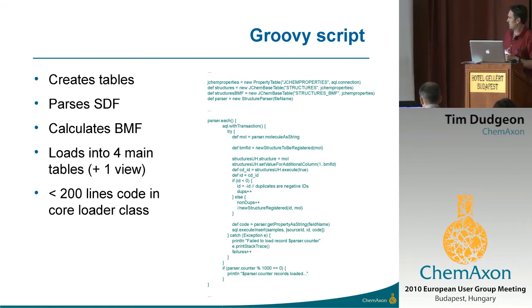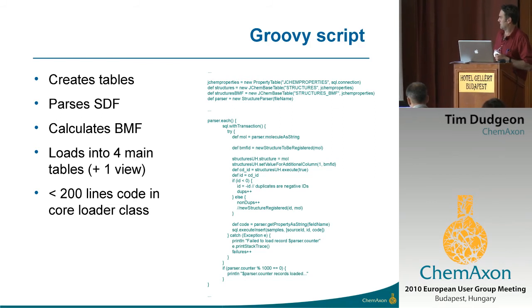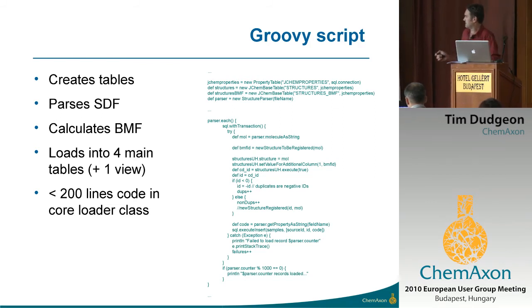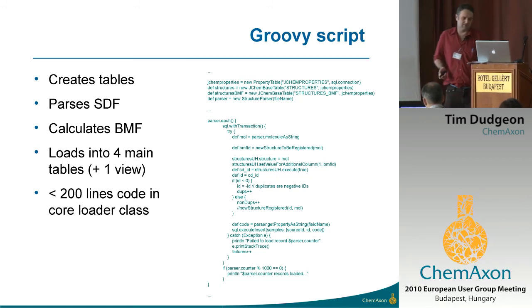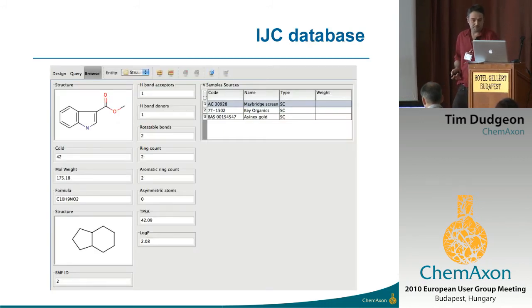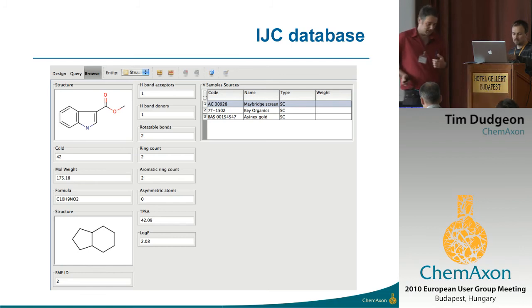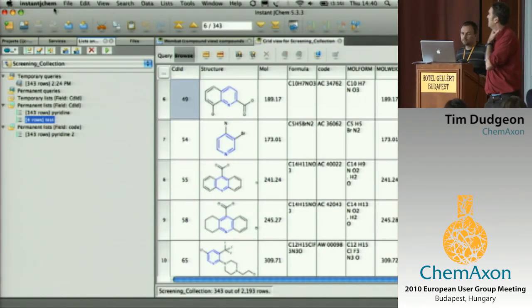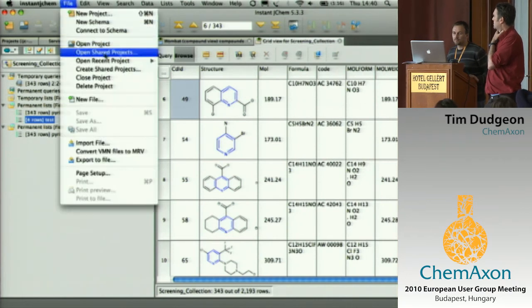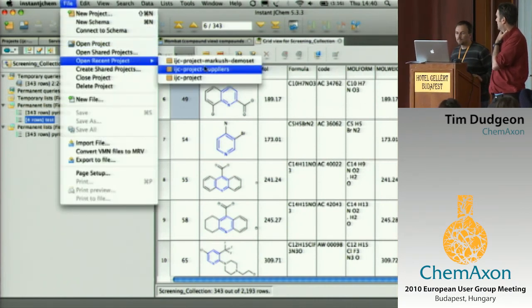And here's just a small sample of the code. You probably can't read it, but with very little code, you can generate this import process. I'll switch over and let Peter demo this quickly. This is a screenshot. We're going to see this live in a sec. He's just now going to switch to a different project that now has this data in.